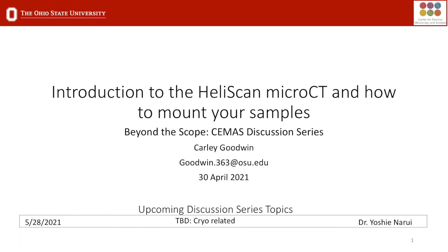Thank you for the introduction, Hank. Good morning, everyone, and thank you for joining me today for today's Beyond the Scope webinar. Today's topic is Introduction to the HeliScan microCT and how to mount your sample. I'm Carly Goodwin, and I'm a research associate here at the Center for Electron Microscopy and Analysis, and I manage our HeliScan microCT system.